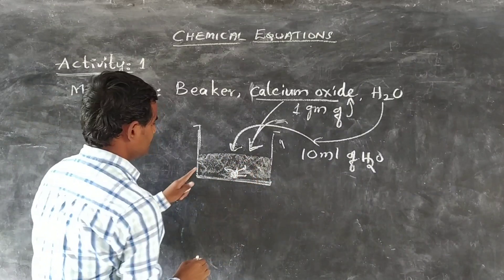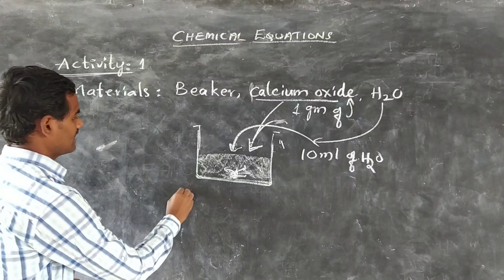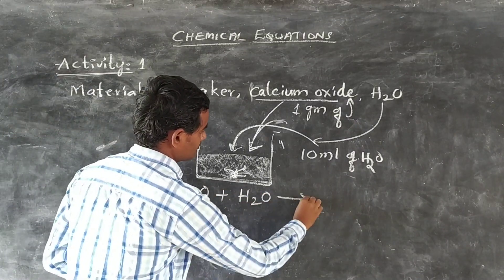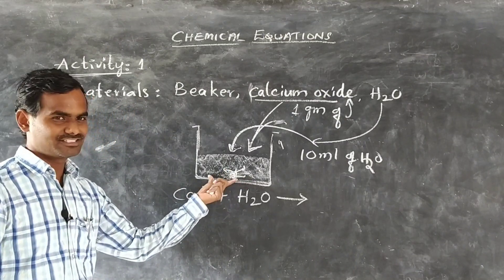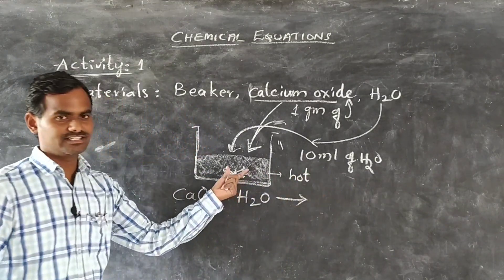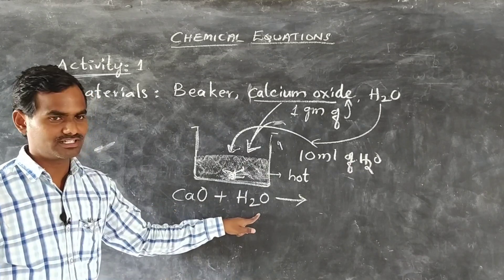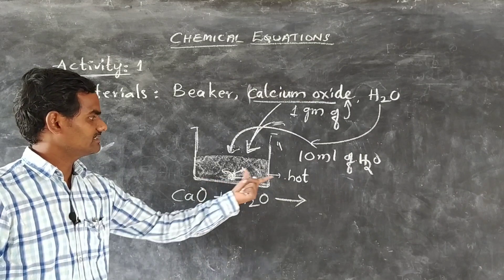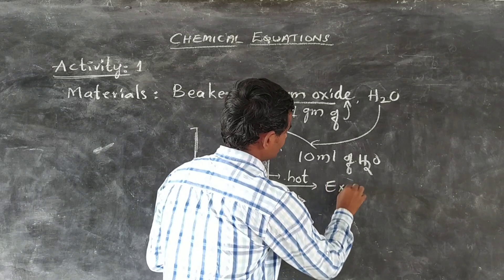When we observe this — calcium oxide dissolves in water and there is a reaction between calcium oxide and water. When we touch this beaker, it becomes hot. It means heat is released in this reaction. When calcium oxide reacts with water, heat is released. This is an exothermic reaction.